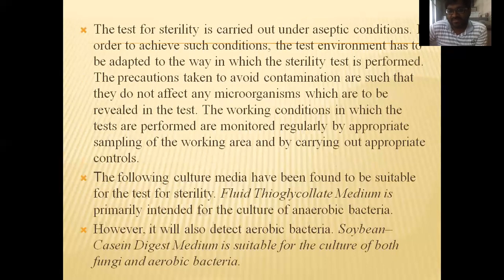So what exactly is this sterility testing? The test for sterility is carried out under aseptic conditions. In order to achieve such conditions, the test environment has to be adapted to the way in which the sterility test is performed. The precautions taken to avoid contamination are such that they do not affect any microorganisms which are to be revealed in the test.